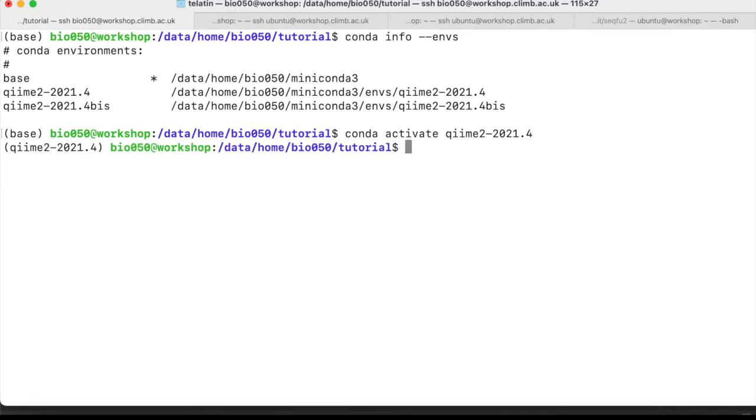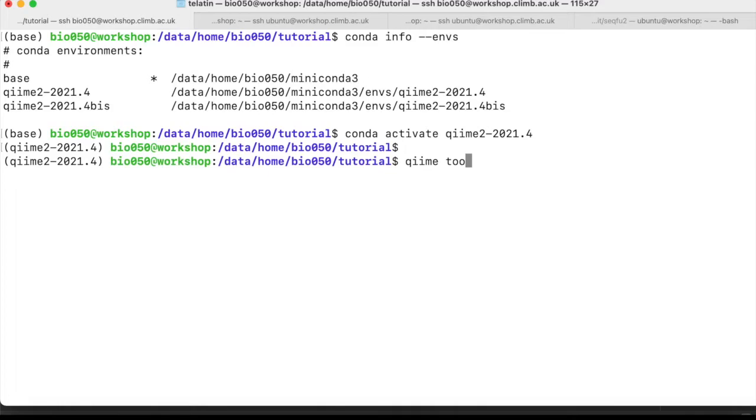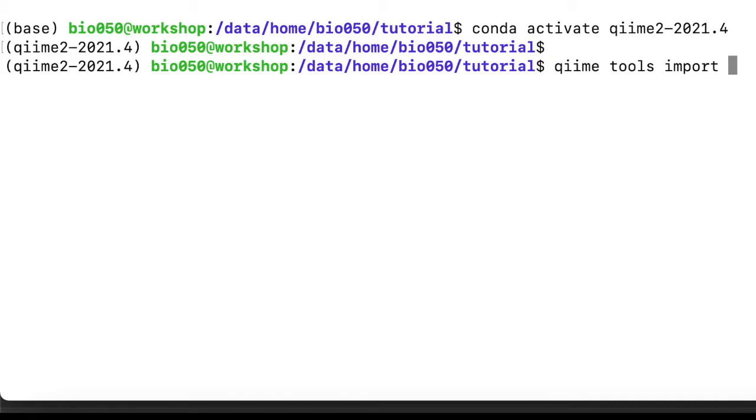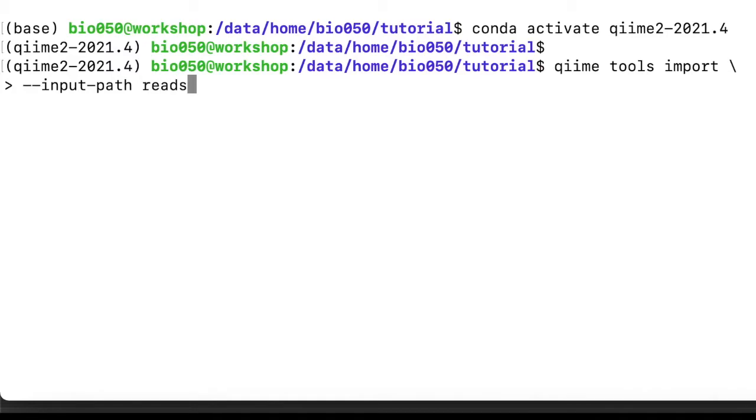So the command is qiime tools import, and then we need to specify some parameters. For example, input-path is our reads folder. I add a backslash, and the prompt automatically changes with this greater-than, that is not part of the command, it's just a way to make the command easier to read.